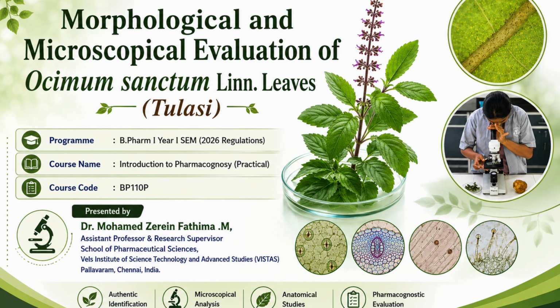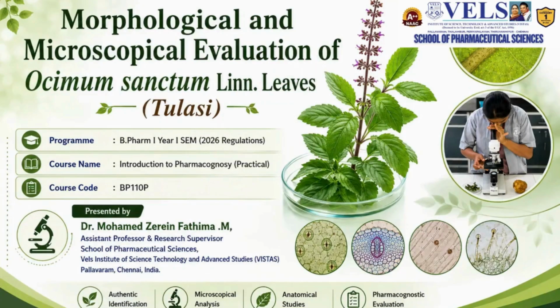Fatima, and today I am welcoming you all to this practical session on the morphological and microscopical evaluation of Ocimum sanctum Linn leaves. It is commonly known as Tulsi. In this session, we will explore its important morphological features and microscopic characteristics, which are essential for authentic identification, anatomical study, and pharmacognostic evaluation.